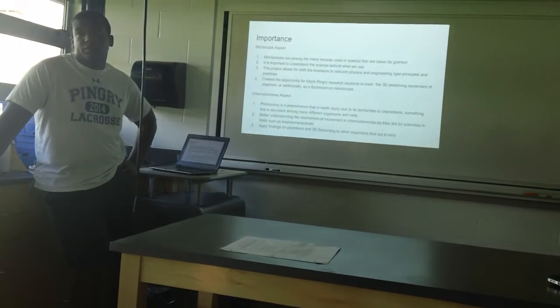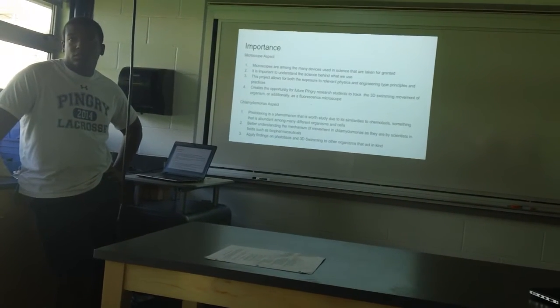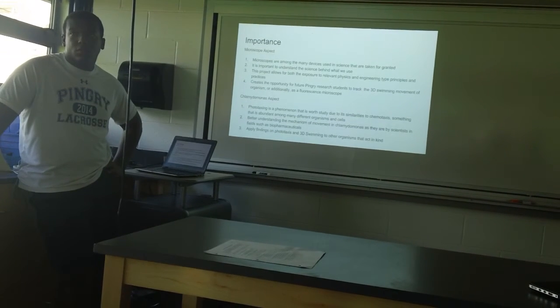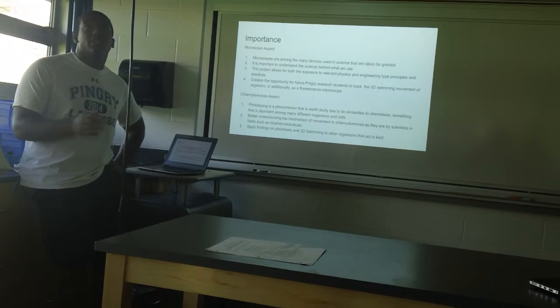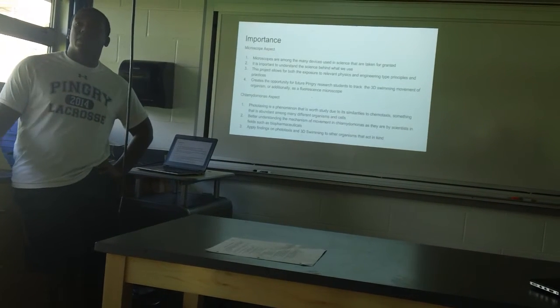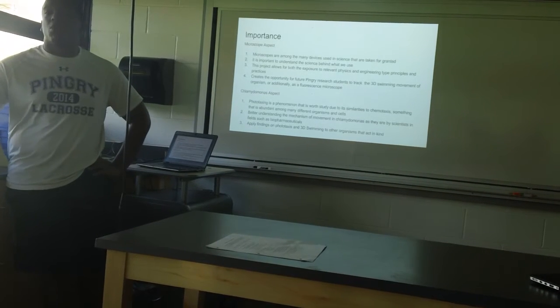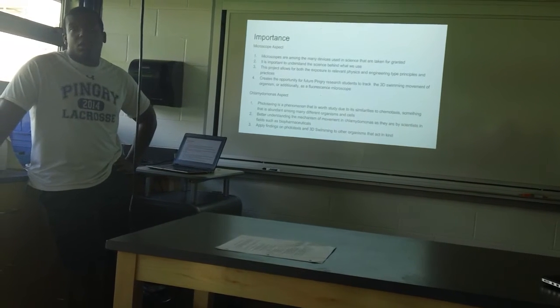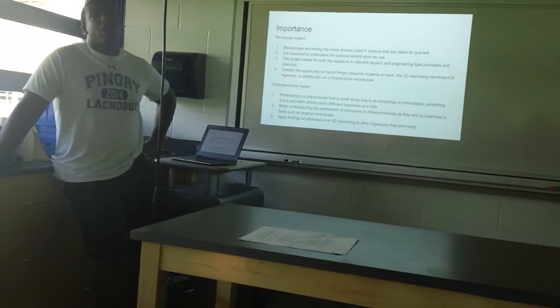If the movement of this thing is what you're going to use to test if the microscope is working, what's novel about the movement of it? It's a give and take. The movement is what we're testing to make sure the microscope is working, and once we know the microscope is working, we use it to understand more about the Chlamydomonas through different tests. And what don't you know about the Chlamydomonas that you're going to use?